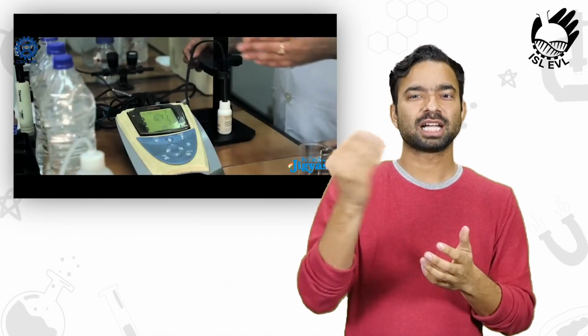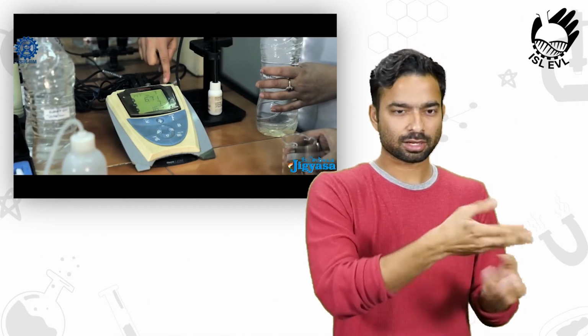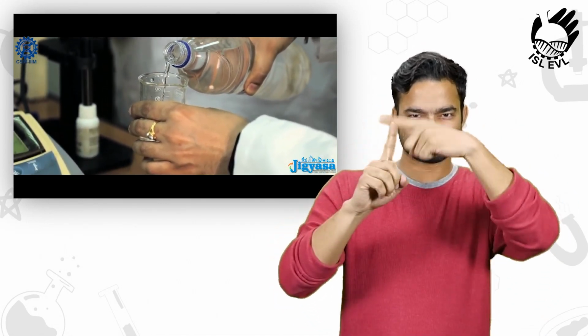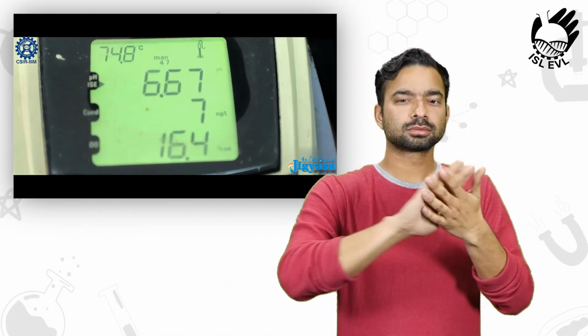Now let's start with pH. These are some of the samples. Let's take one. We are going to see the pH of this sample. For pH, we are going to use the pH meter. This is the calibrated pH meter. This is the electrode which is going to tell the pH. So water is being poured and we are going to measure the pH. We are going to take 50 ml of water. The electrode is being dipped into the sample which is being tested. Here is the pH. The pH is 6.69.